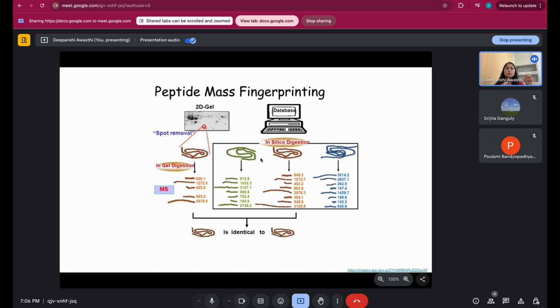In the database there could be multiple proteins. Now, in silico digestion means the digestion which is theoretically performed. For example, in the experiment I have performed tryptic digestion and obtained certain peptides. So I will take the protein sequence from the human proteome database and cleave it by looking at the positions where K or R comes. Wherever lysine and arginine come, I will chop off, and I will obtain that sequence theoretically, as it would be broken by the trypsin enzyme.